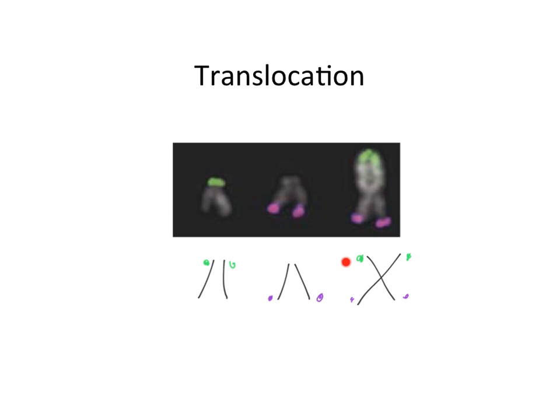The strange thing is that one chromosome demonstrates hybridization to both the green and the purple probes. So what's the interpretation of this? This suggests the presence of a translocation, that is, the physical fusion, say, of the telomeres of this chromosome to the telomeres of that chromosome.